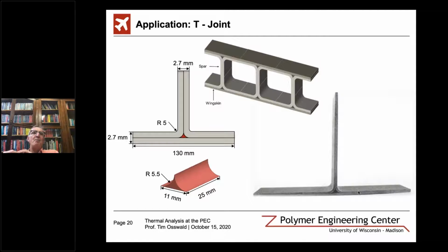Of course, this part here is trivial because we can't deform that part that much, but in an autoclave, the 3D printed part is relatively critical, because as you heat it up, it becomes weaker.